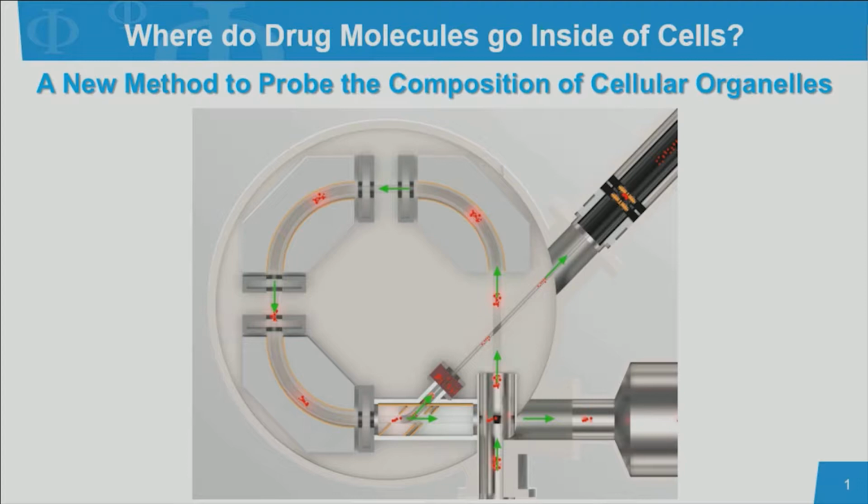Up until now, there has not been a good way to know for sure which subcellular compartment specific compounds are located in. Mary Kraft, a collaborator, had a quite elegant idea to achieve this task: to define subcellular organelles and put a tag or a marker so that we can identify where we're looking within the cell. I'll get to that in a few slides.